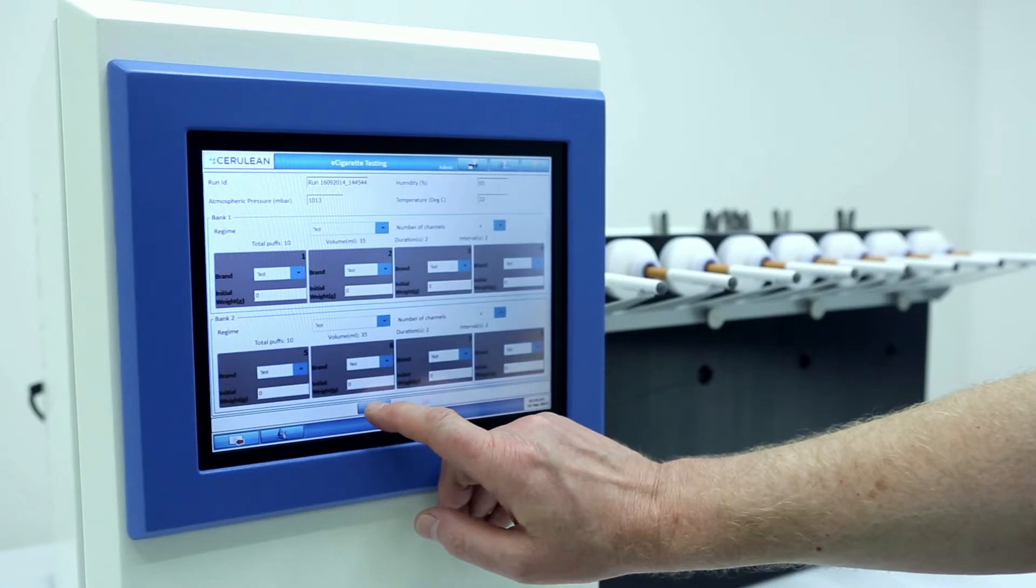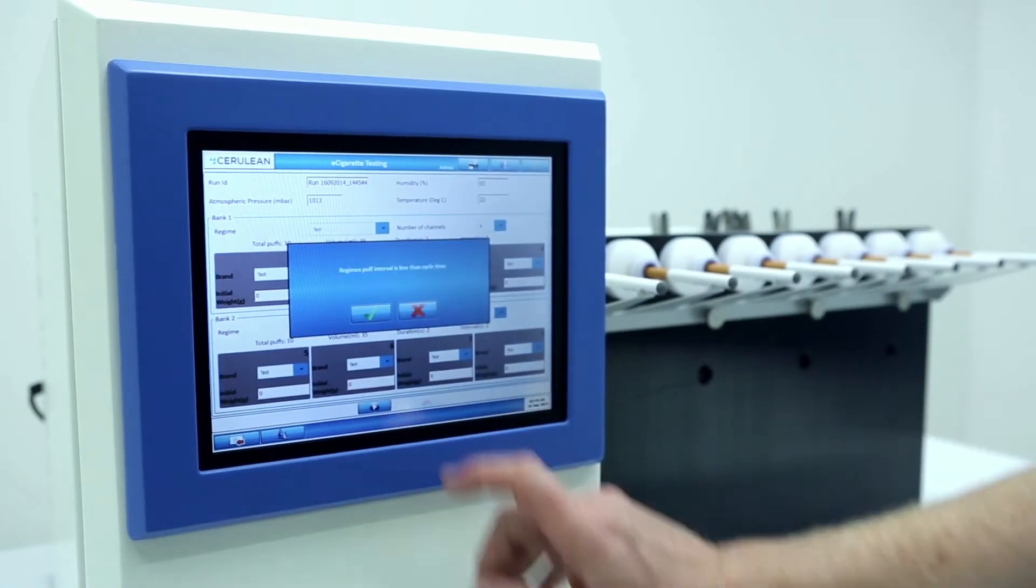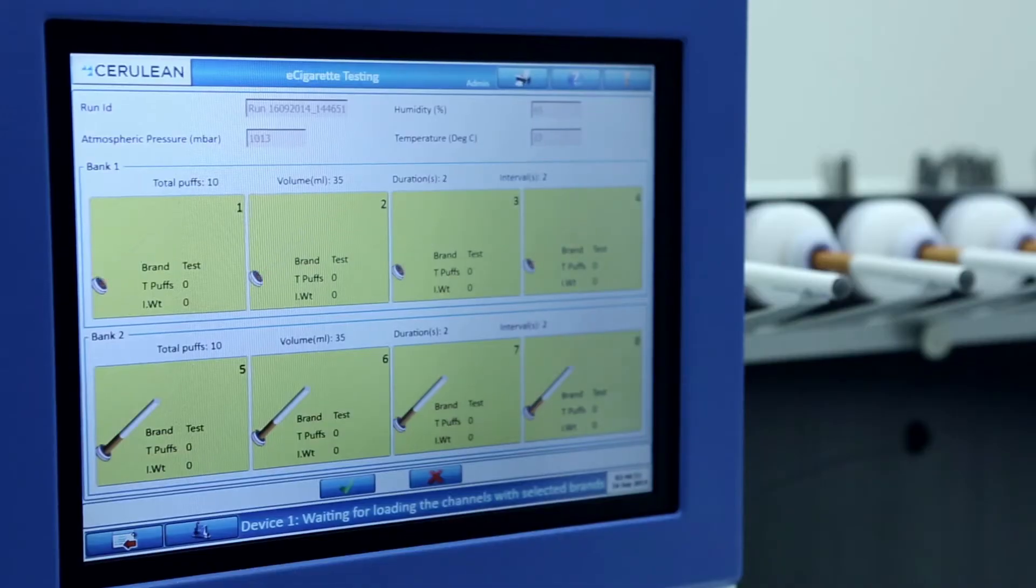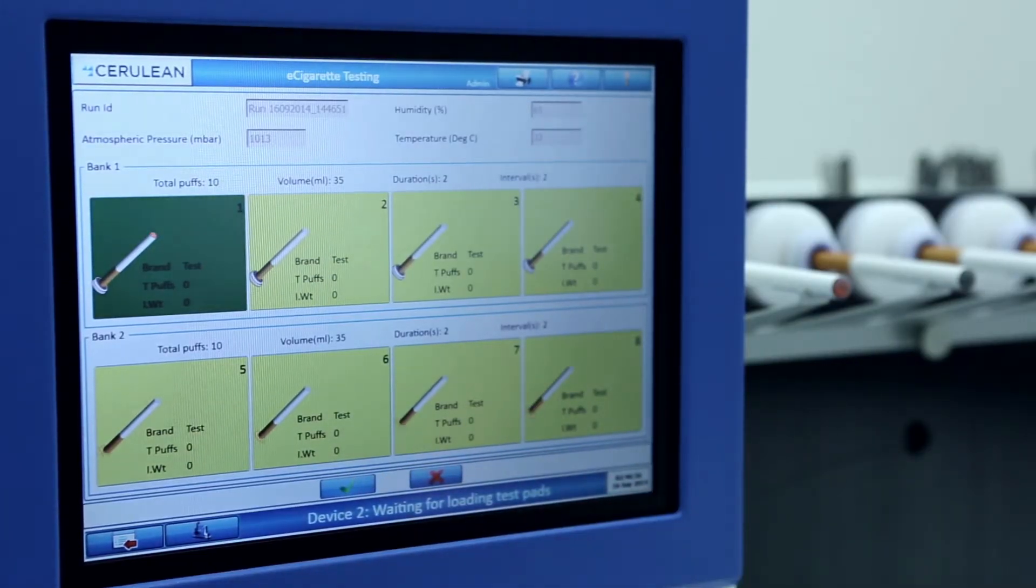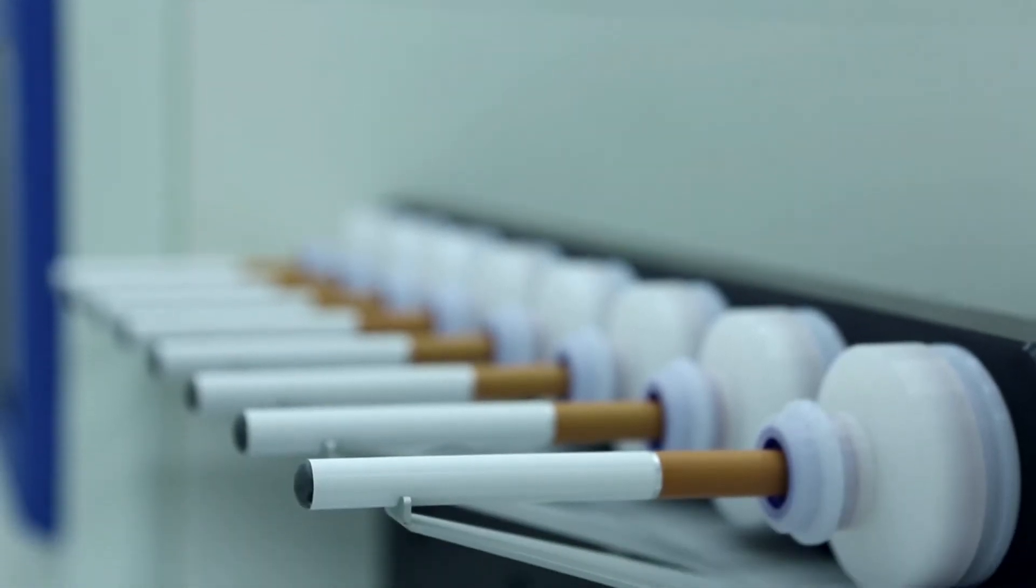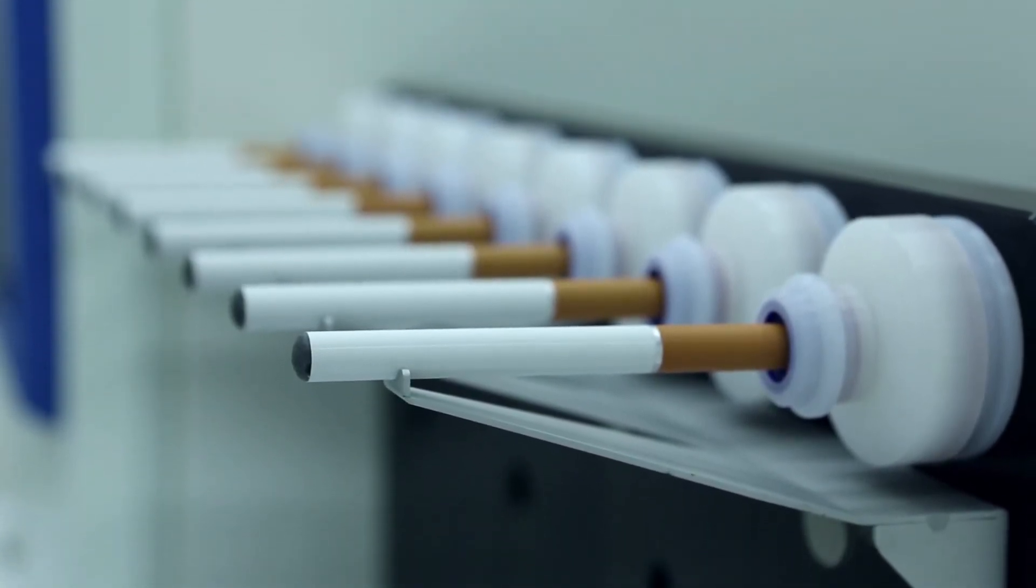The CETI-8 is controlled via the intuitive touchscreen user interface. Using the interface, the user can select different puff profile shapes with the choice of the ISO sine wave or the square wave, which is Coresta's recommended waveform.